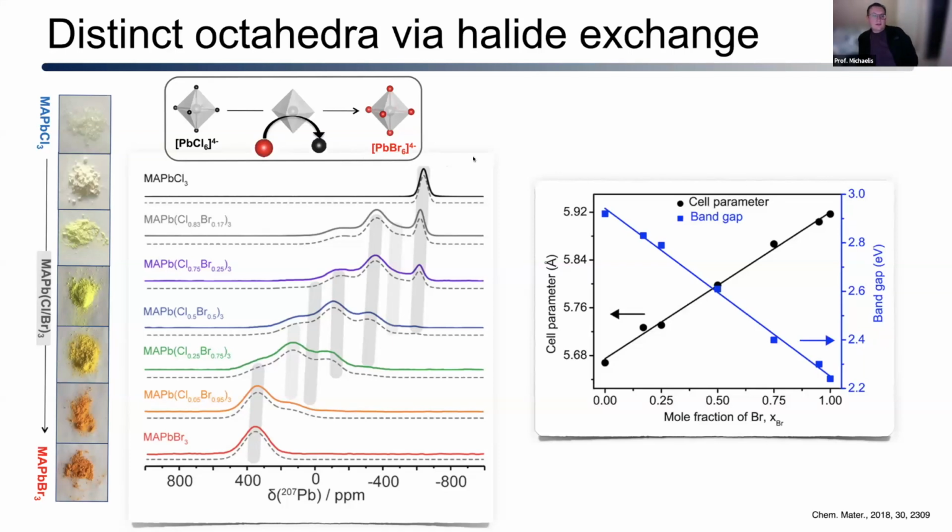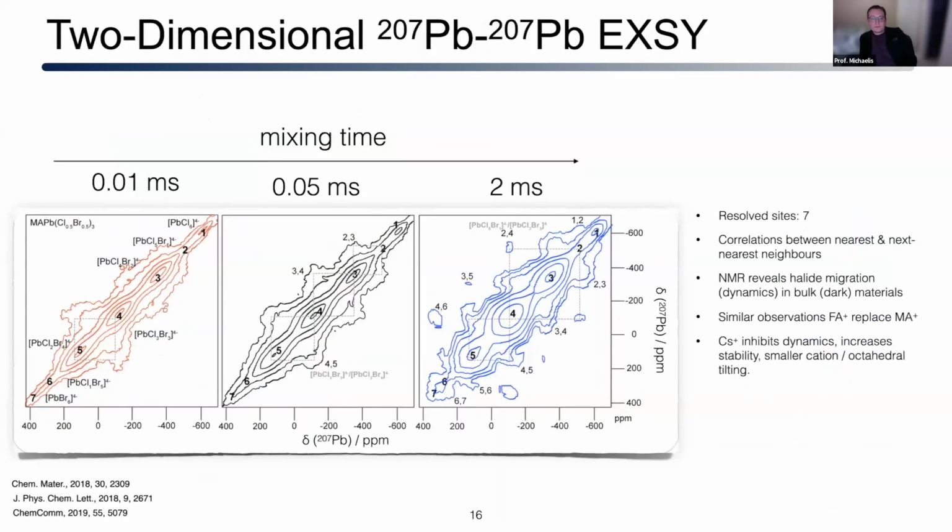And you can see that depending on the chemical environments you have and the ratios, you can have either a homogeneous or a heterogeneously mixed system. What I mean by that is you either have statistically random chlorine and bromine neighbors, or you have some type of clustering of bromine or chlorine neighbors, depending on the technique that you use.